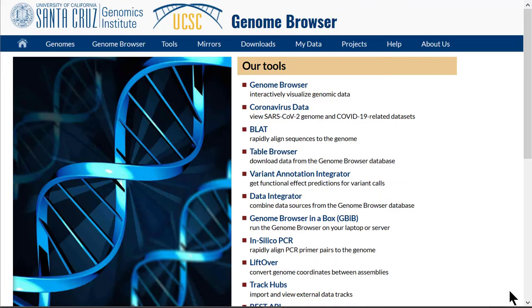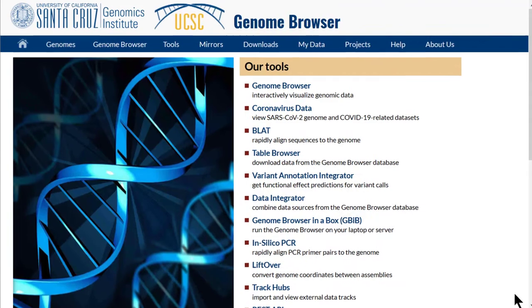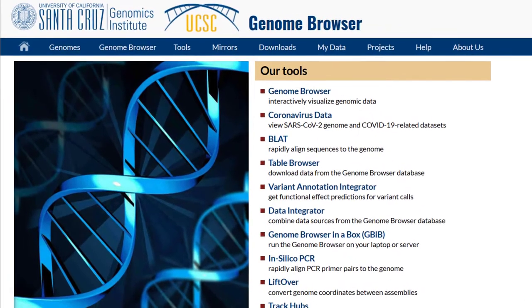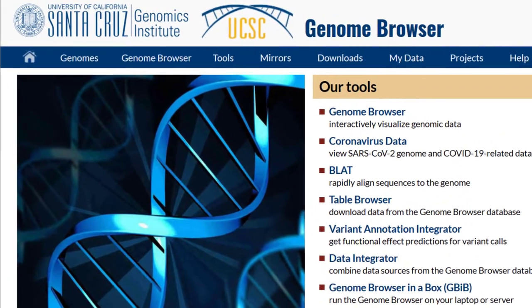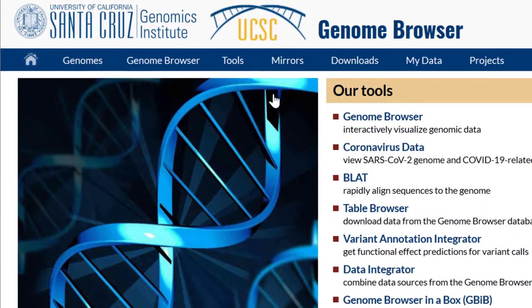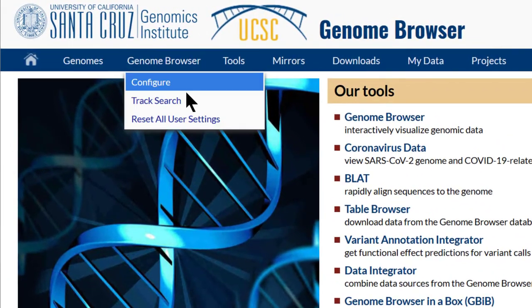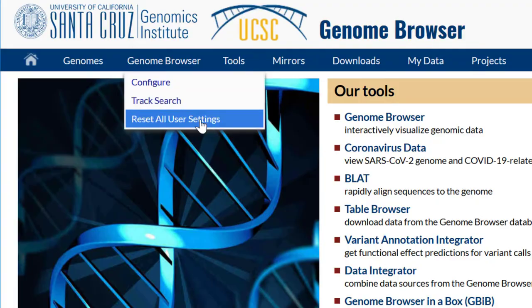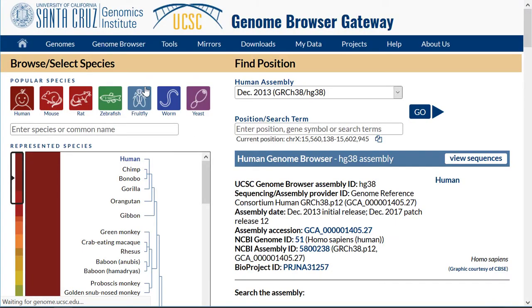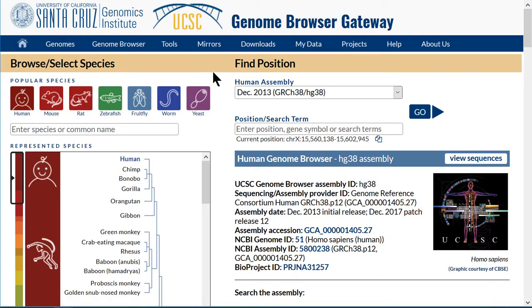We will start by going to the browser at the default location. Reset all user settings in the top toolbar sets us at the HG38 human genome assembly. We will use HG38, but most of what we will see is applicable to any genome assembly. The go button will take us into the graphical viewer.